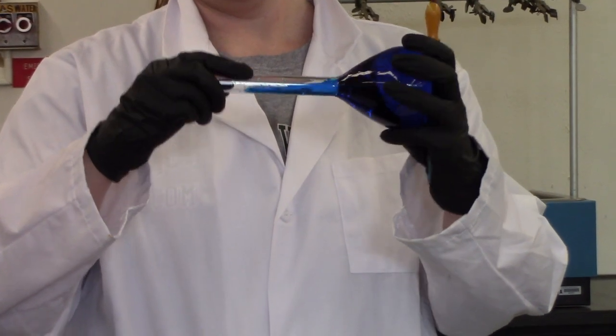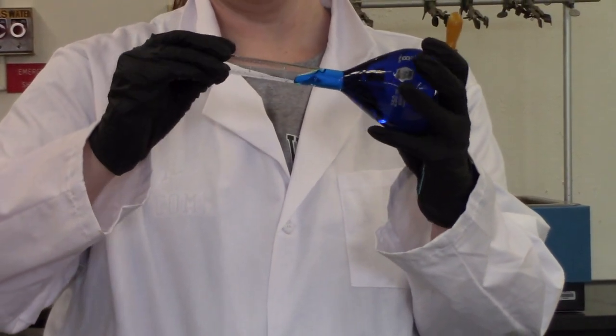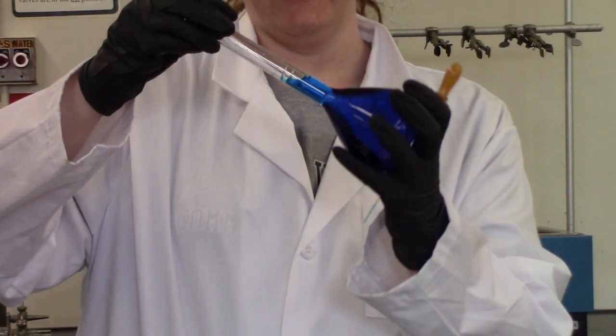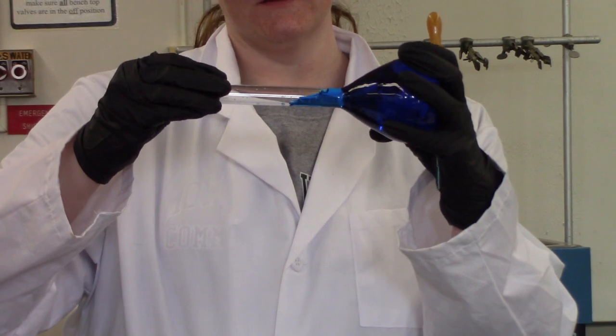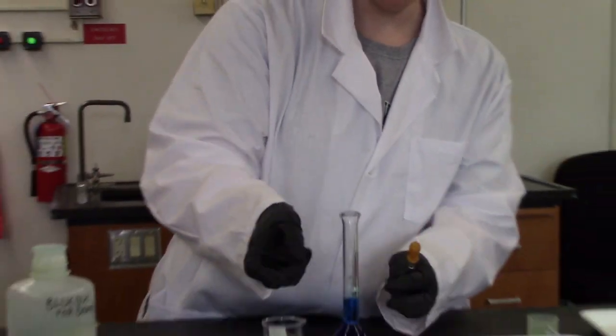But you can also sort of do this trick where you turn it from the neck and sometimes those drops will come down, okay? We want to try to get everything below the line before we fill it to the line, because otherwise we have an additional amount of liquid that's not accounted for.